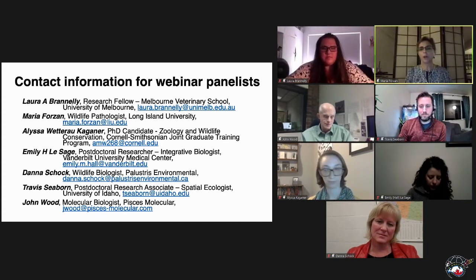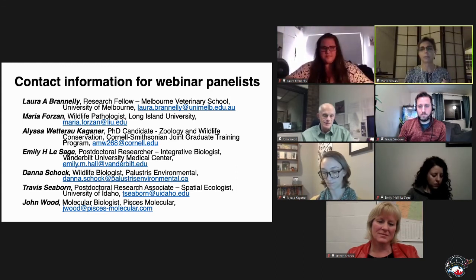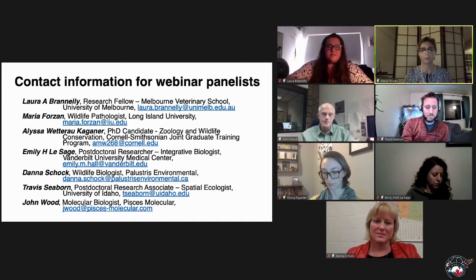I just wanted to add on the ethanol thing. Some people, and I know it's probably no one who's participating in the webinar, definitely none of the panel, but just in case, some people use ethanol for disinfection. And that's a bad idea because ethanol will preserve the DNA, so it might inactivate it, but it does not clean as bleach or other substances do. So that was my spiel on ethanol.